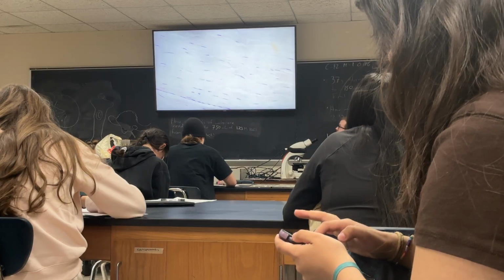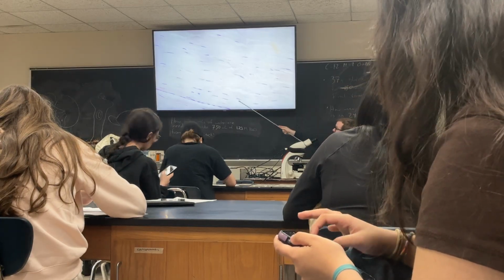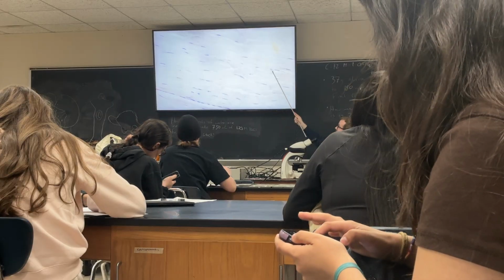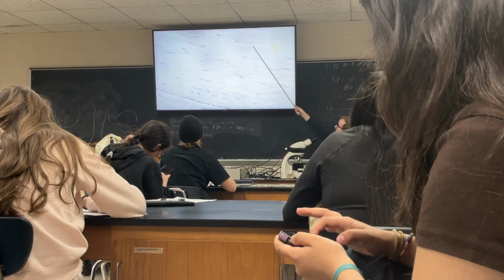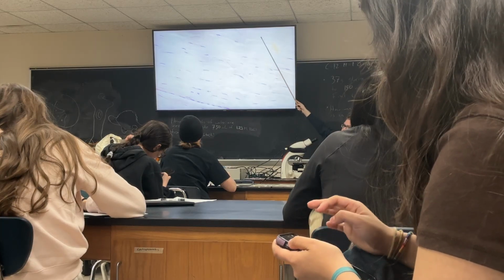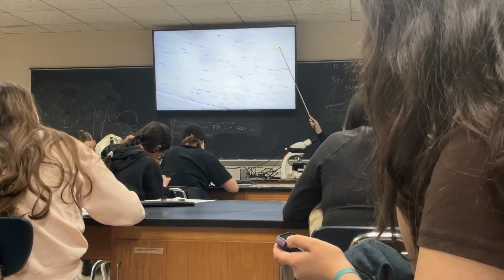Not nearly as many cells, and the cells that are here are crushed. Those aren't too bad, but these guys are all flattened completely. Just look up here in this corner. Not a cell to be seen because there's so few. If this was smooth muscle, I'd at least see 5 or 6 just within that little area.